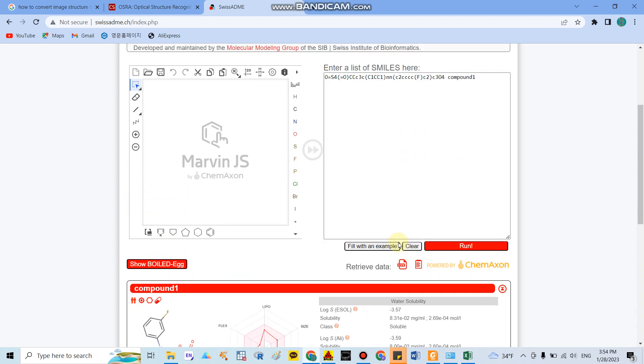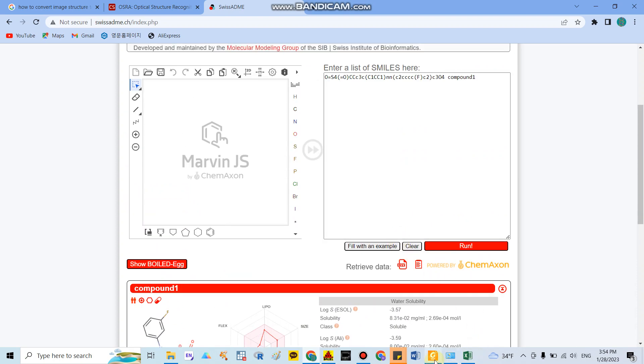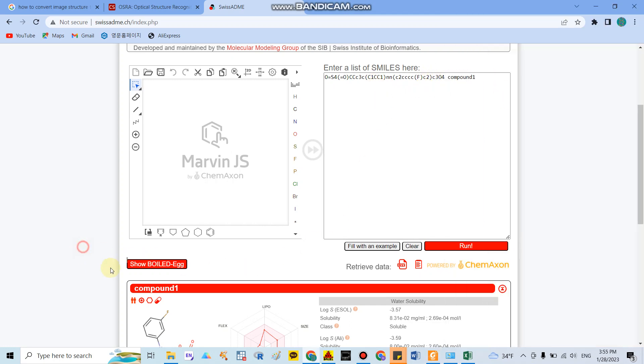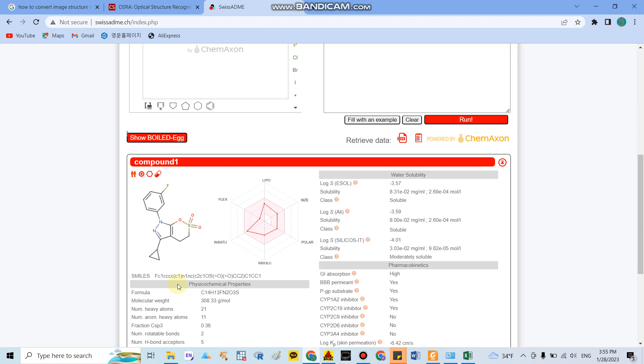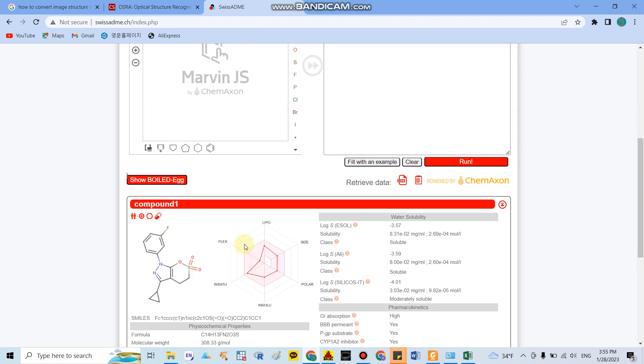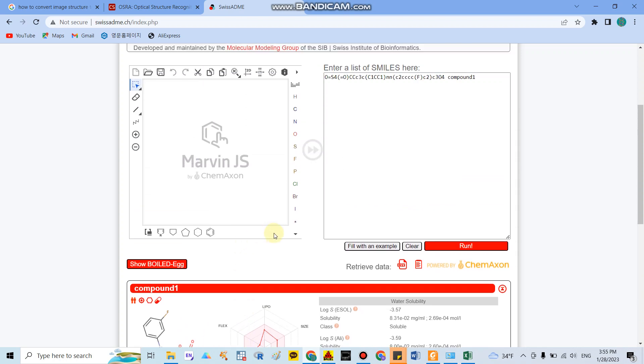So in this video I showed you how to analyze the physical chemical properties from the image files, and you can get the SMILES and you can predict every characteristic of the compound you want. Thank you for your listening.